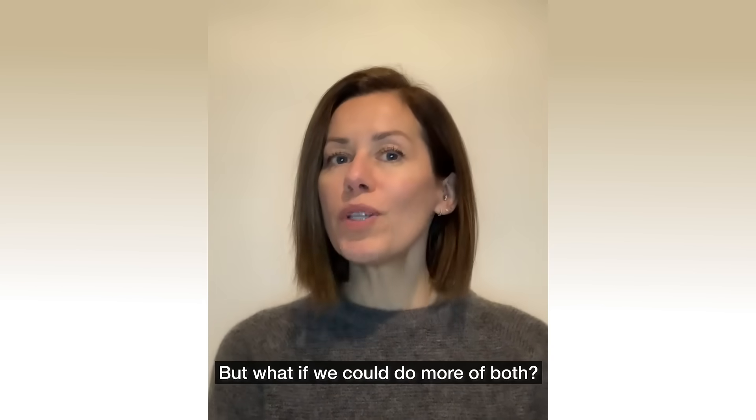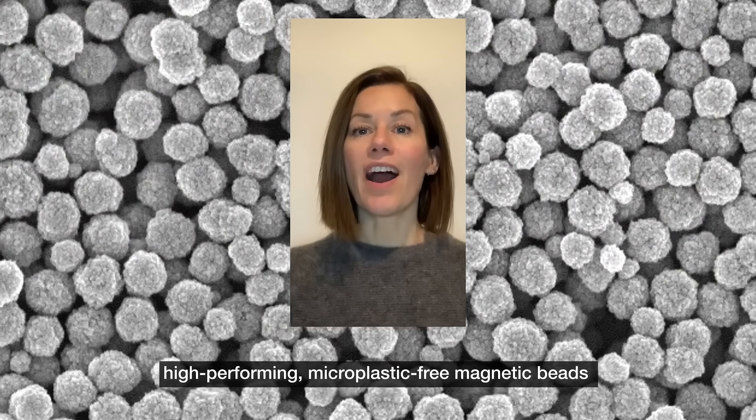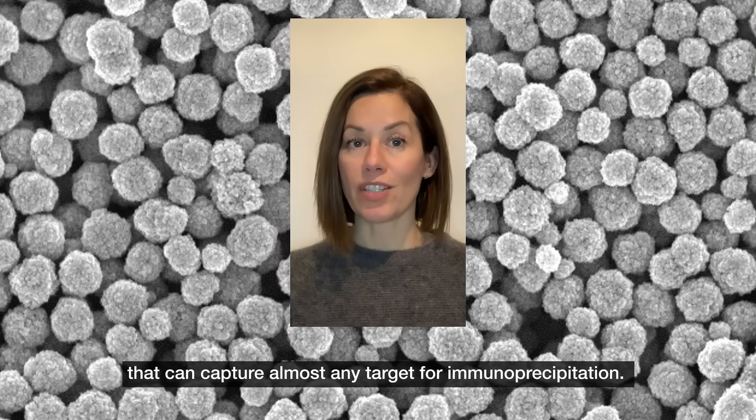Life scientists often make their impact in the lab, not on the environment. But what if we could do more of both? Invitrogen DynaGreen Magnetic Beads Platform is a pioneering, high-performing, non-microplastic magnetic beads platform that can capture almost any target for immunoprecipitation.